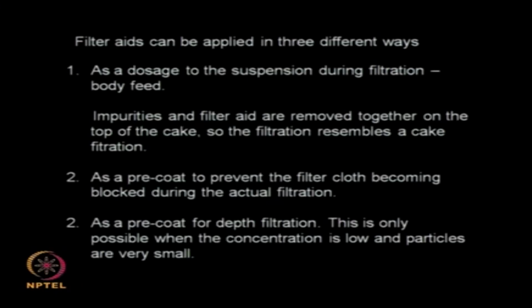So you need to consider all these aspects before deciding on the type of filter aid you would like to select as well as the particle size of the filter aid. These filter aids can be applied in different ways. I can add the filter aid as a dosage to the suspension during the filtration process.